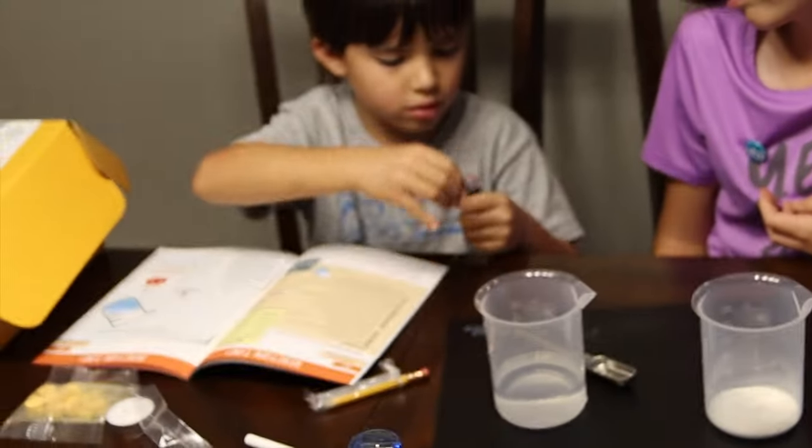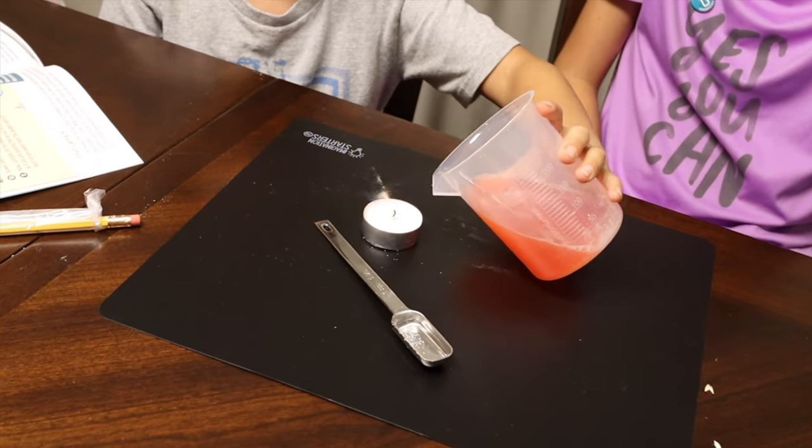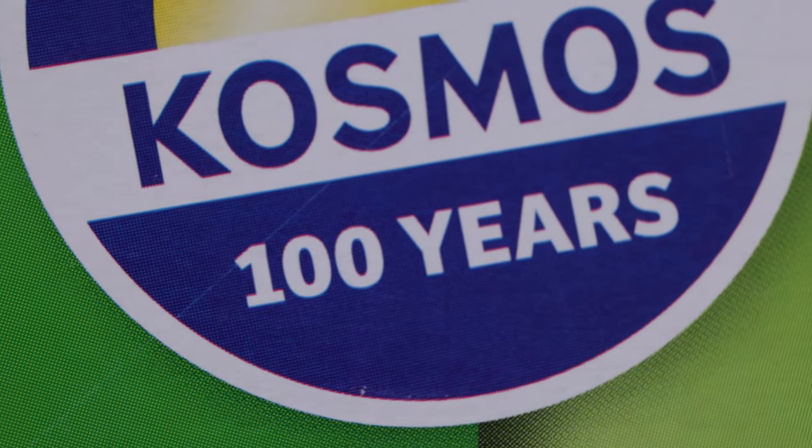As I've mentioned, I've used a lot of chemistry sets with our kids and reviewed them on this channel. Much like the Yellowscope product we reviewed about a year or two ago — which I really liked and still do — after reviewing this kit, I would say the Yellowscope is most beneficial for late elementary and early middle school, while the C1000 kit by Thames and Cosmos is much better suited for middle school and high school grade levels.